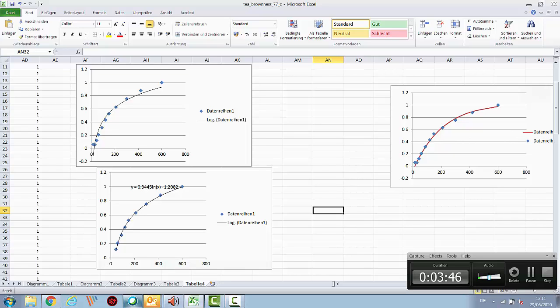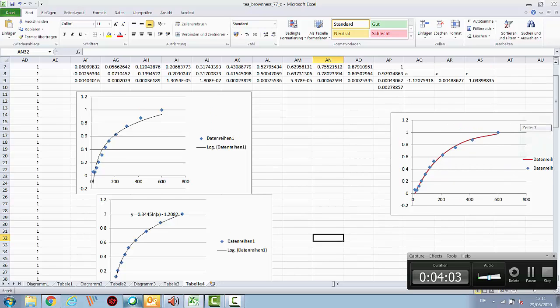And then we can have a look and see what happens, and we can see it does follow very well, even the last point is on, so we could have this log curve, which is shown on the diagram at the bottom left there, and at the top with this red curve on the right.